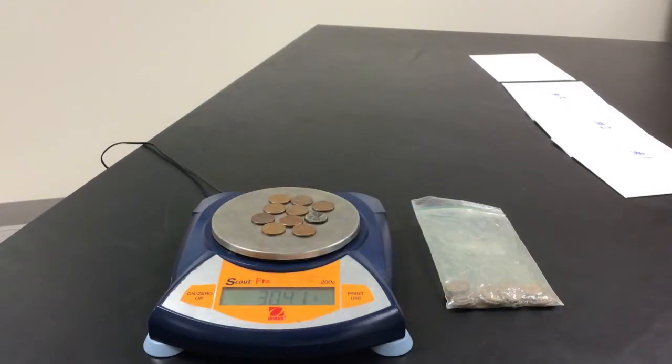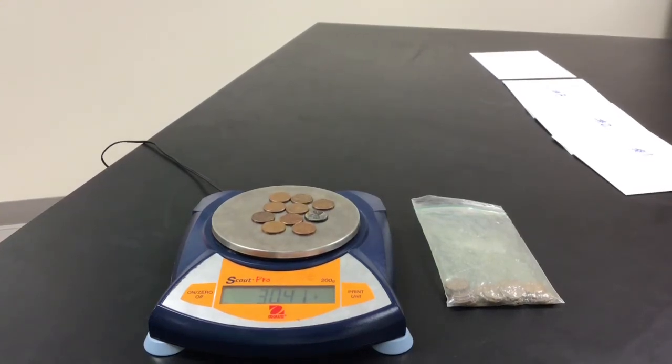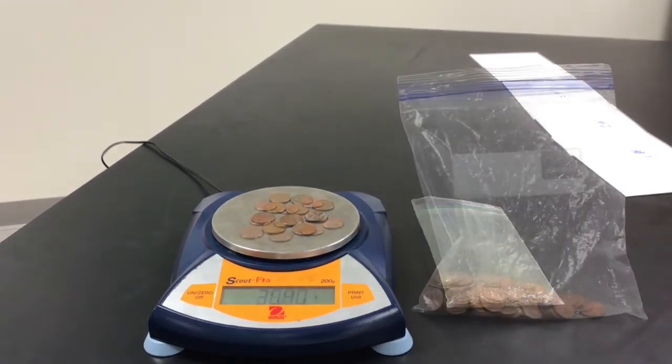Now I place 10 old pennies on the balance. As the balance shows, it's about 30.41 grams. Write that number down in number 2, then calculate the average mass for a single old penny.